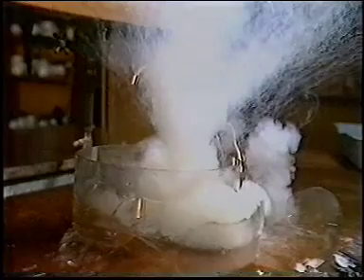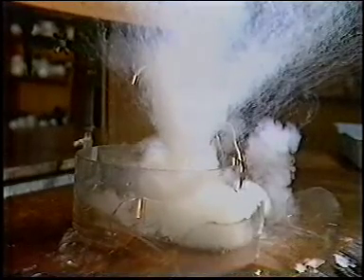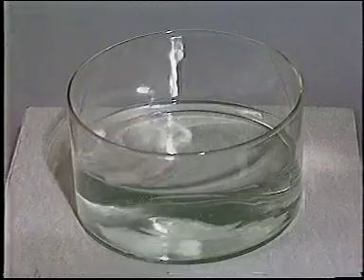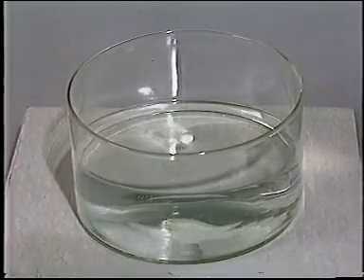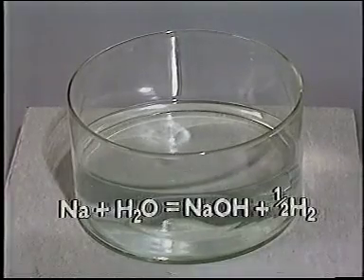You may remember that reaction from the foundation course, when the reactions between alkali metals and water were demonstrated, and how violent some of them were. If sodium metal is added to water, a vigorous reaction takes place. On reaction, sodium hydroxide is formed and hydrogen gas evolved.